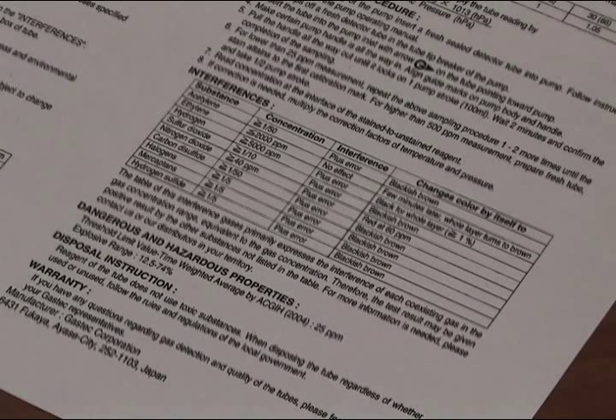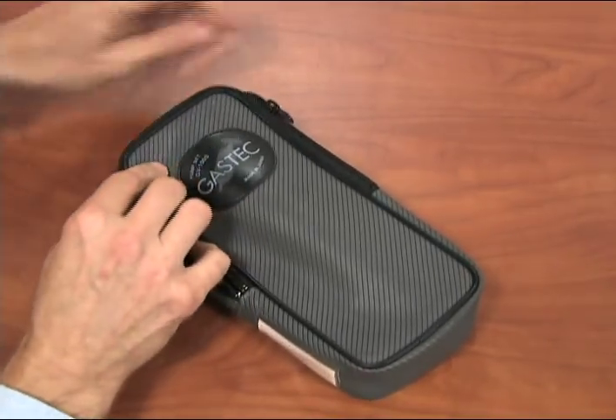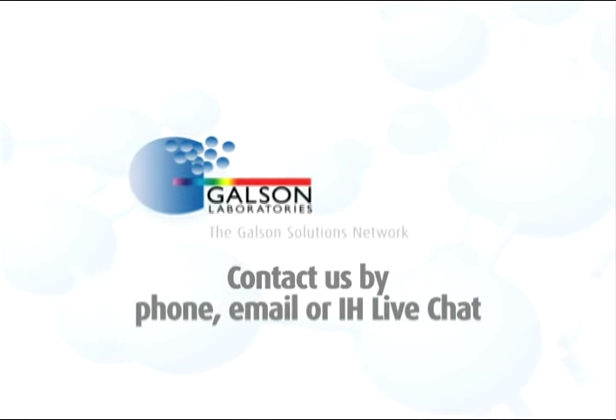The instructions tell you how to dispose of the tube after you are finished. When finished, repack the pump and ship it back to Galson Laboratories. For questions, contact Galson Laboratories by phone, email, or IH live chat. You may also access our extensive library of other helpful videos at GalsonLabs.com. Thank you.